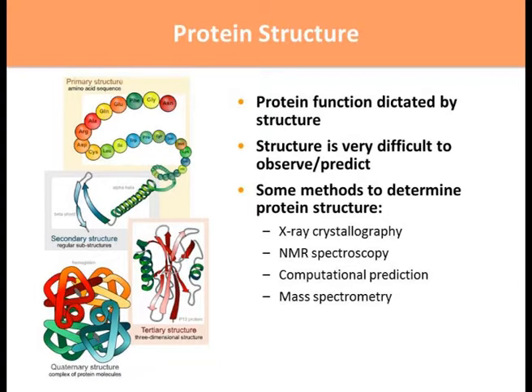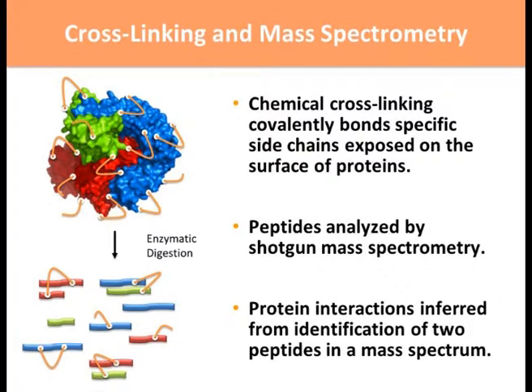And therefore, they are also limited in the number of proteins that can be studied this way. So mass spectrometry hopes to circumvent these issues, and I'll go into detail as to how that is done. As Rob has shown you this slide already here, as you can see, you can take any protein complex of interest and chemically cross-link it.